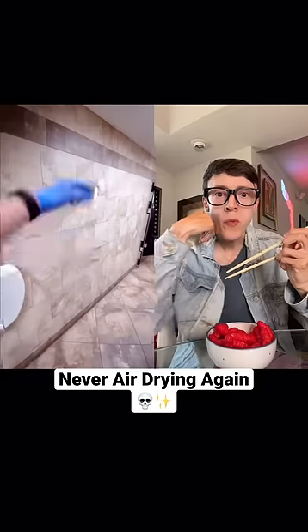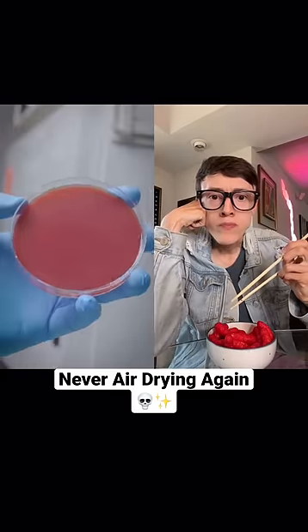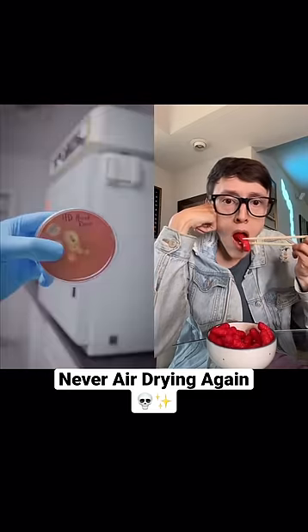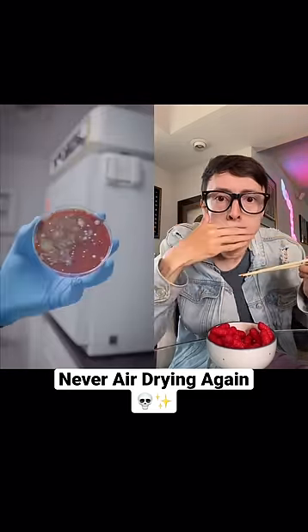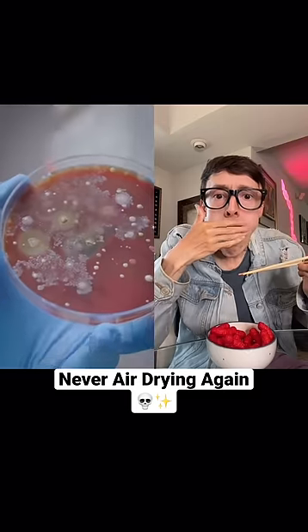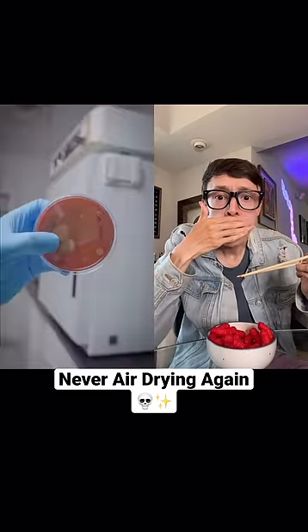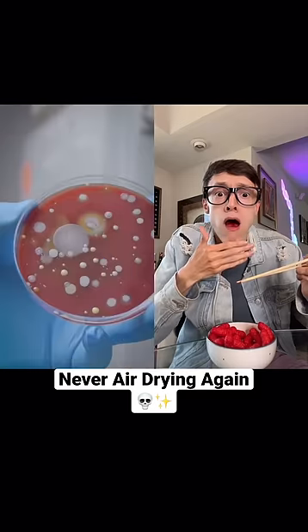First, let's see how the shaking — or the wave dry — worked. As far as I can tell, there's no visible growth. And here's the hand dryer in that same location — there's still quite a bit of nasty stuff coming out of that. This one's at a gas station. Still pretty nasty.